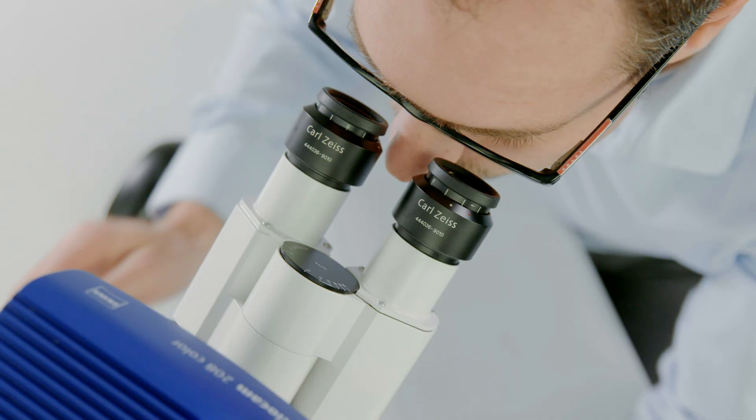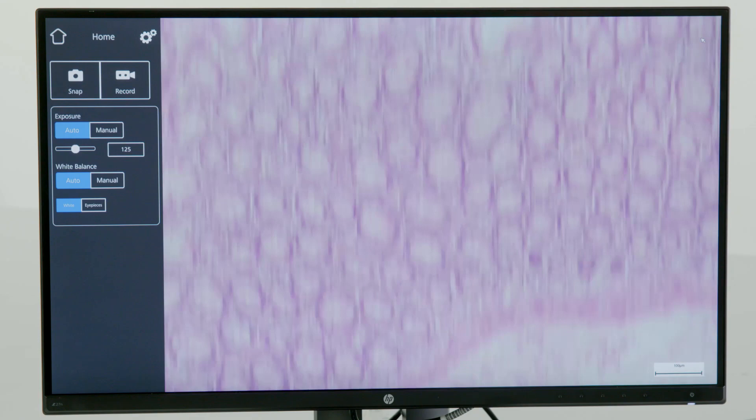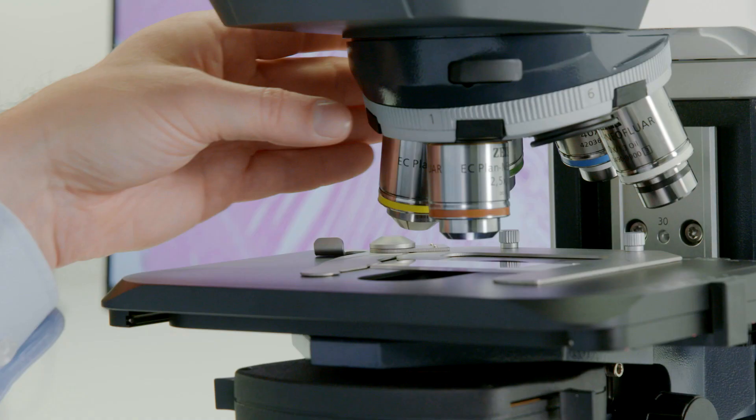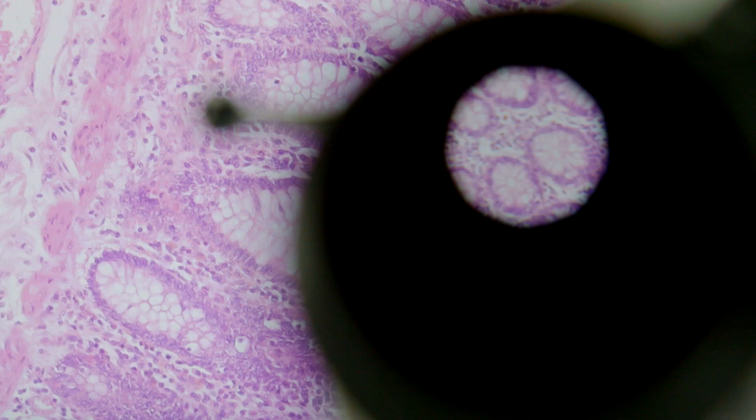Use a low magnification objective to focus your region of interest, then switch to the magnification you need. The monitor and the eyepieces will show the same region of your sample with the same color impression.